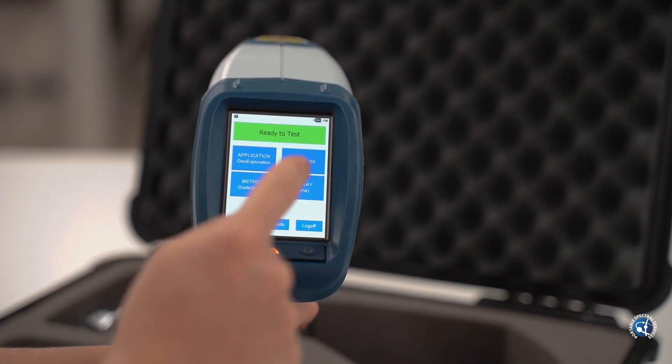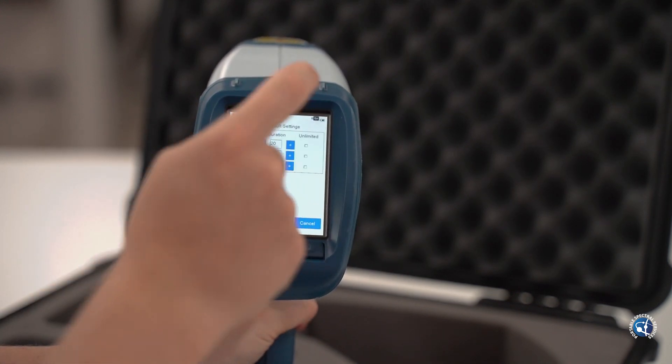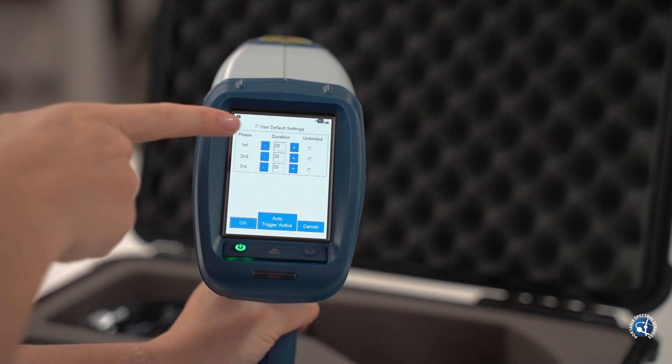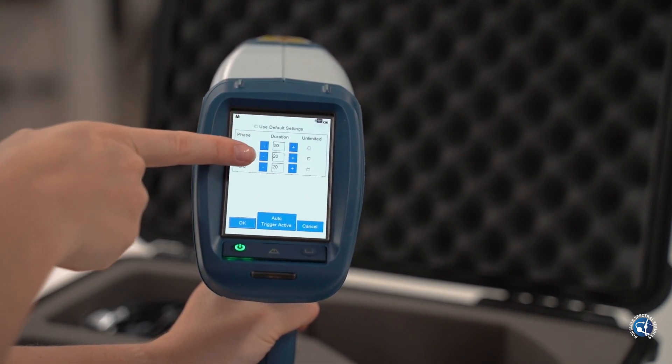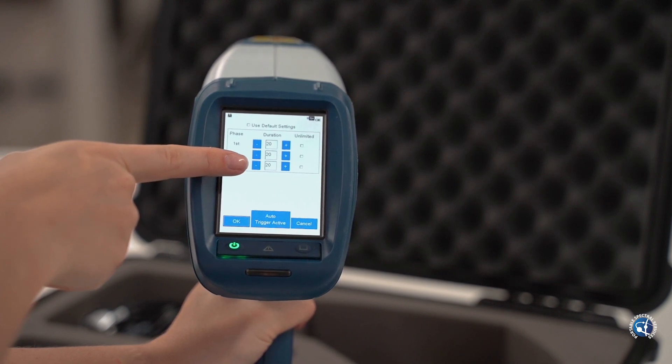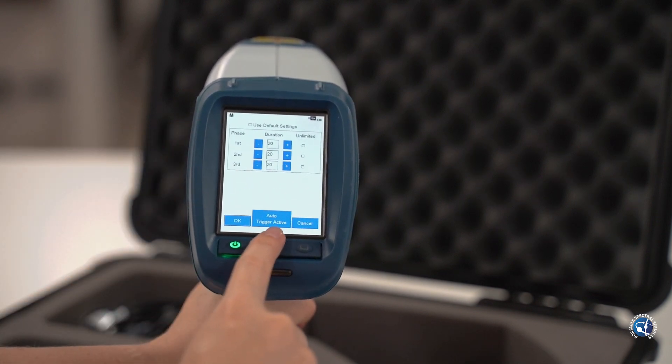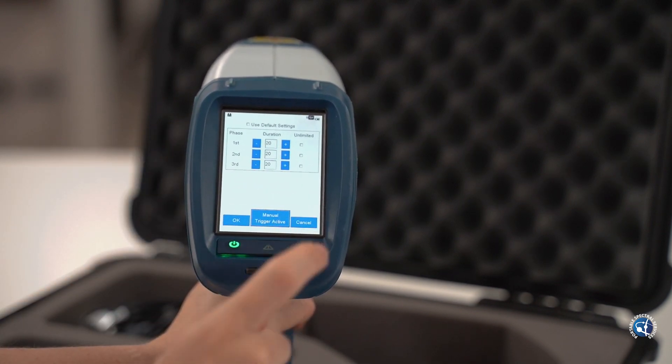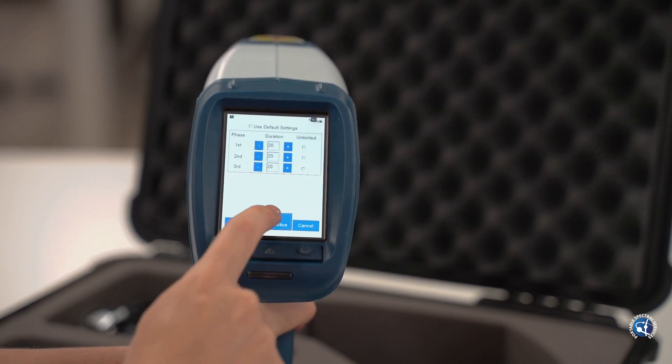From here check the settings and ensure that the beam times are at the recommended length. For example, for geo-exploration we recommend 20 seconds per beam as this allows full acquisition of all the elements in that calibration. Anything shorter than this will not be a reliable result.